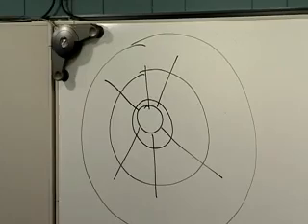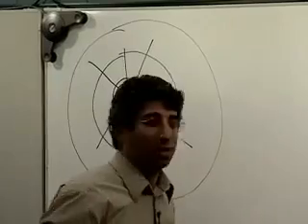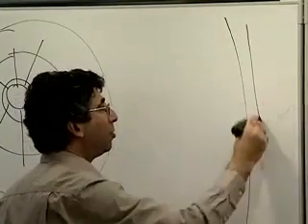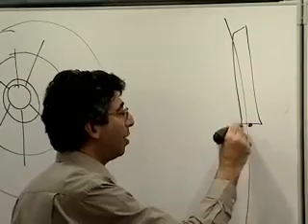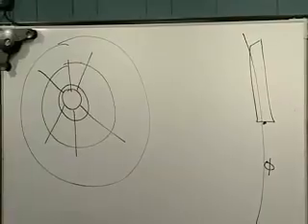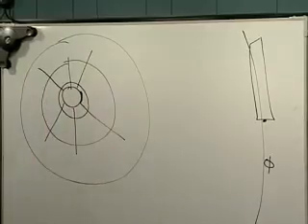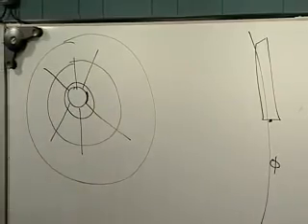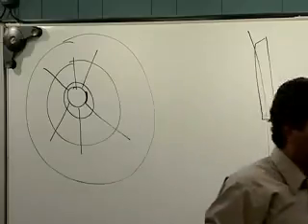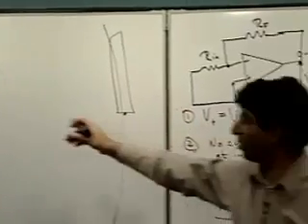Now, in fact, when you go and you take your reference electrode, let's have another equipotential surface way out here. What you're actually measuring is where the tip of your reference electrode is. So if it's right there, you're going to measure the potential of that potential surface. Now, if that potential is close to the potential right here, no problem. But on the other hand, if instead of putting my reference electrode over here, I go out into the next building and put my reference electrode, then it's going to be cutting a potential surface. This is a very big, I guess, cell I have now. It's cutting a potential surface that's nowhere near this one, and it's the wrong number.